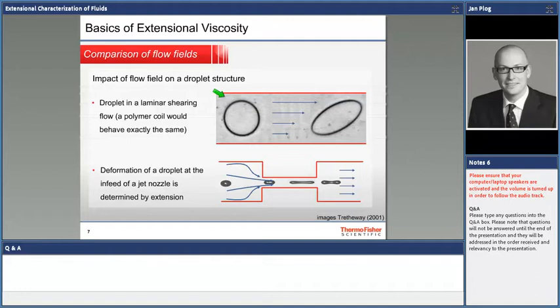And some of you might know already that those back relaxation processes, that we can then measure as first normal stress difference, or the elastic component in small amplitude oscillatory shear, the G prime, the so-called elasticity, is what causes many problems in applications. And again, we dig into more detail later. But now when you see this, and you know that this is pain already for the structure in the fluids that you work with, imagine how much pain your system feels when you actually extend it.